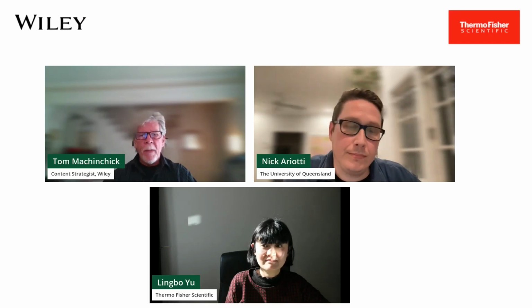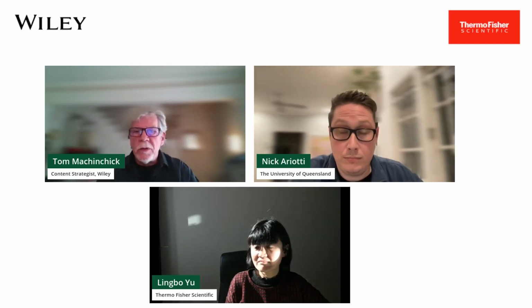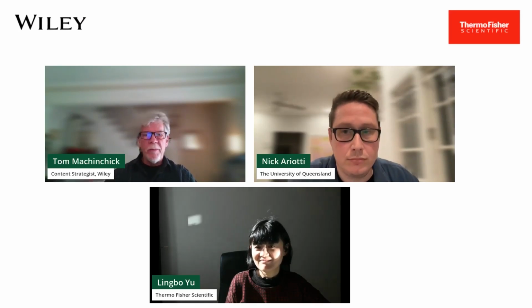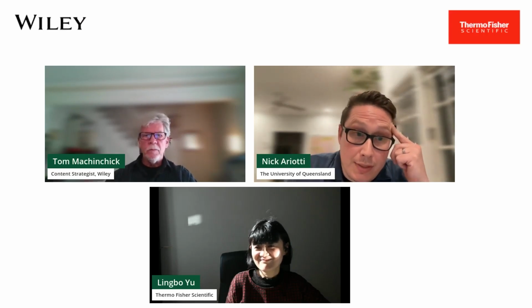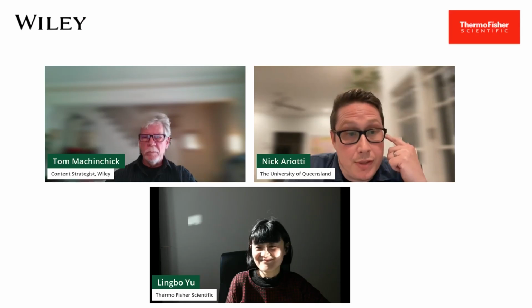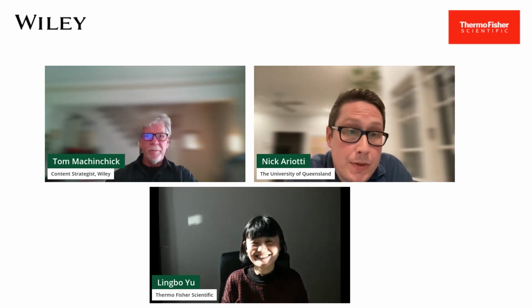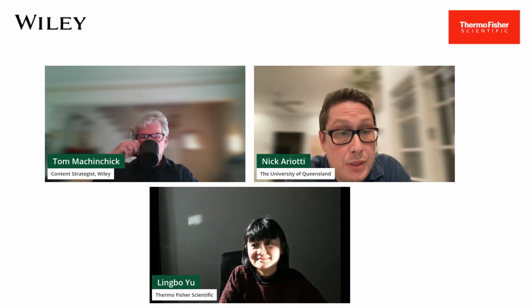Okay. Could you comment on the complexity of the subtomogram workflow? The packages you mentioned are new to me. How challenging is it to learn them? This is a question that I receive every time I present this data. First off, all the software that we use is in the public domain.